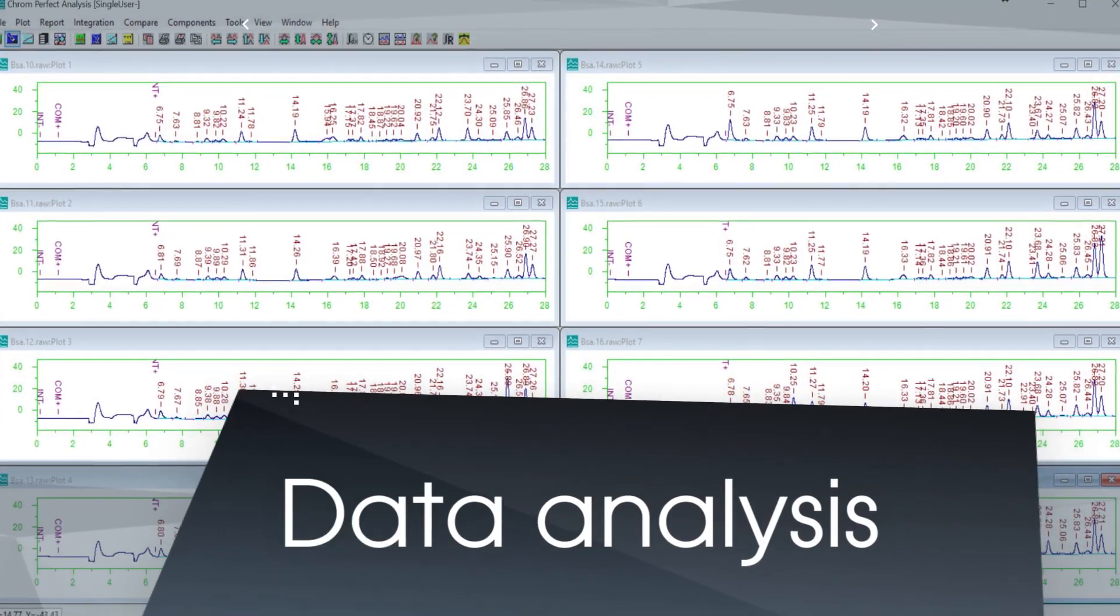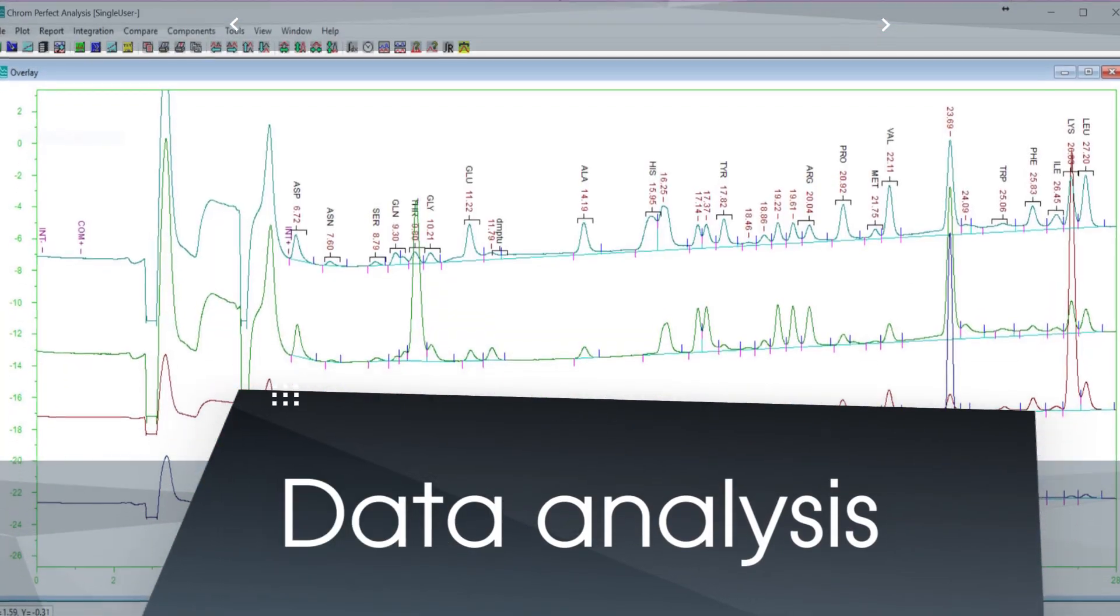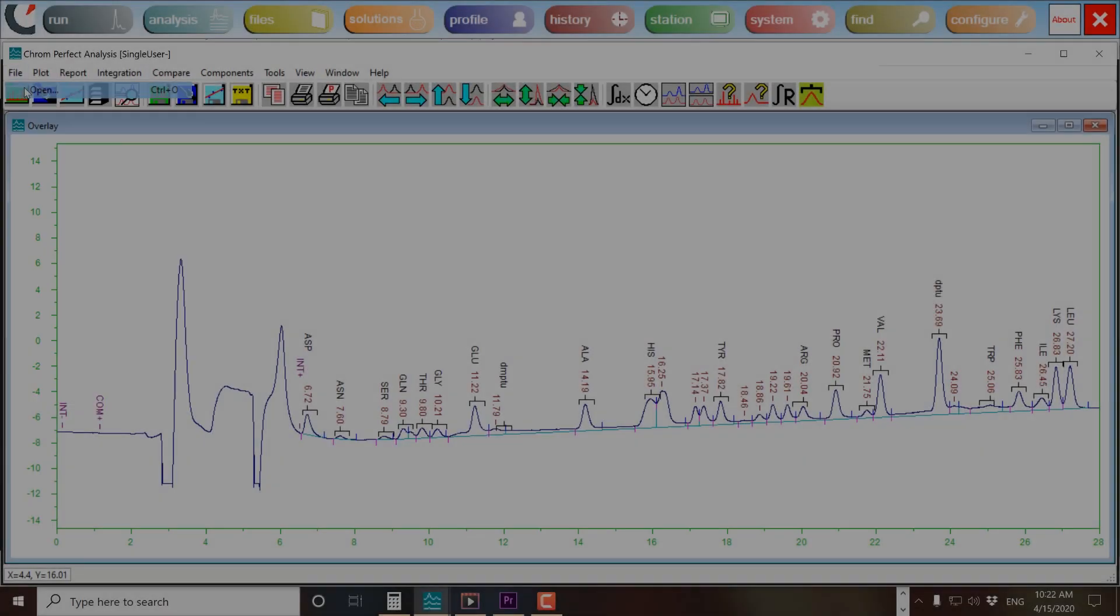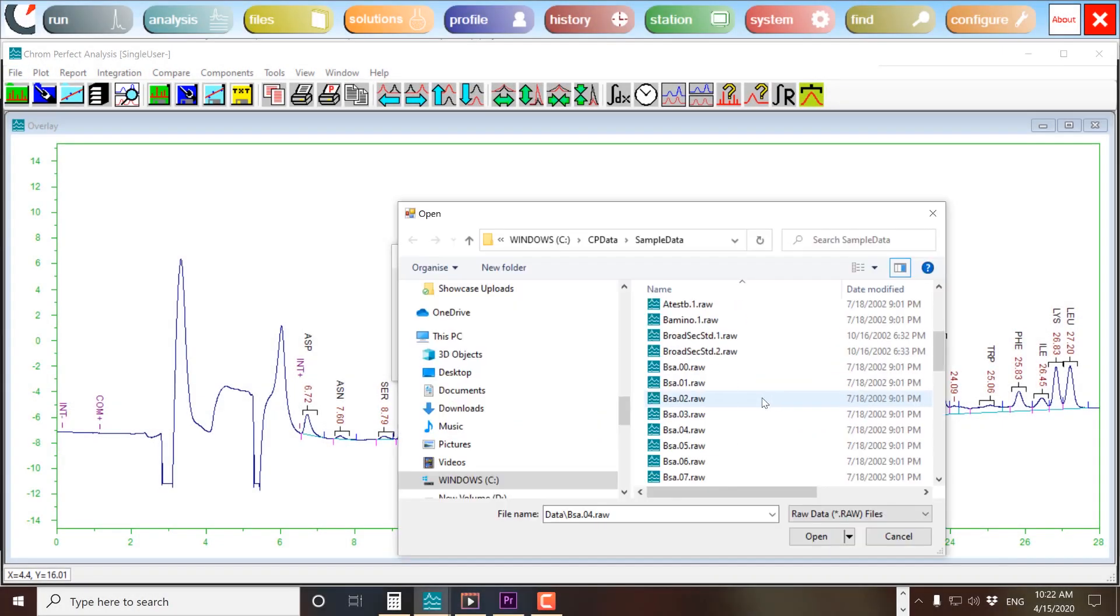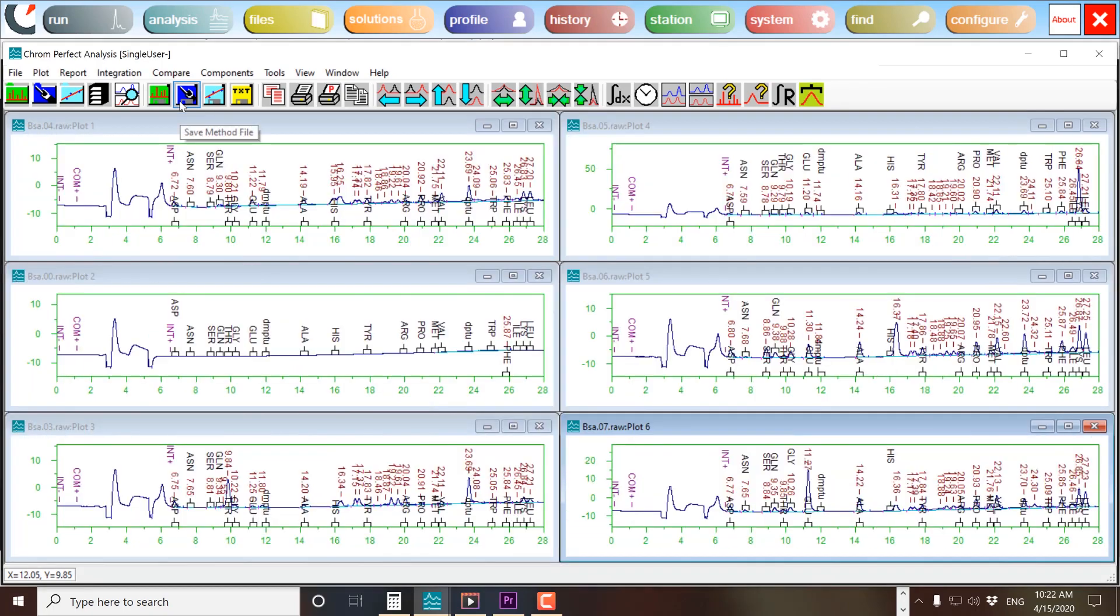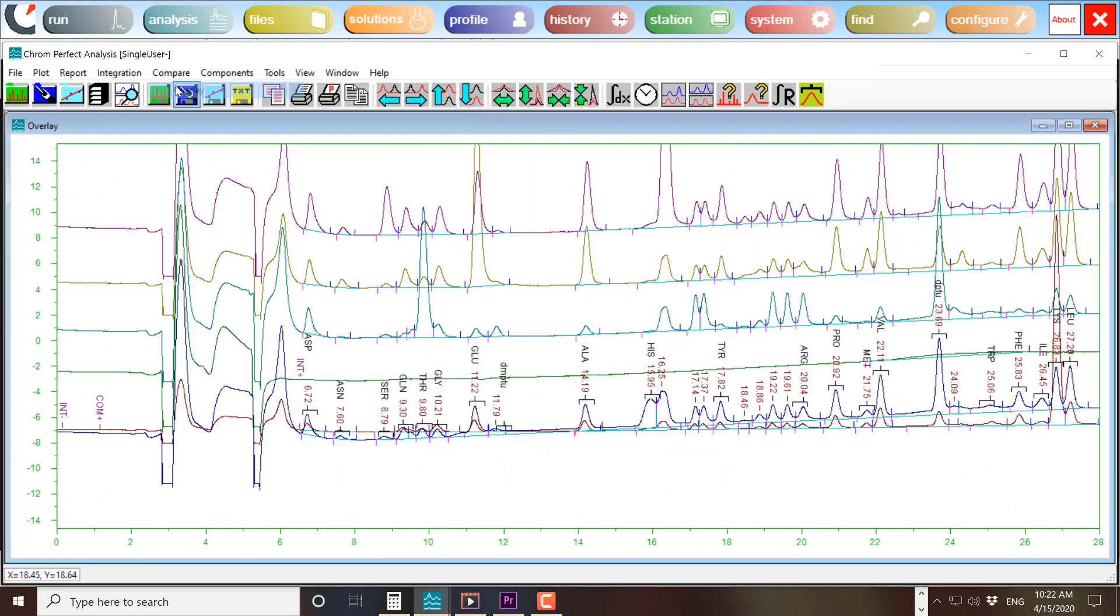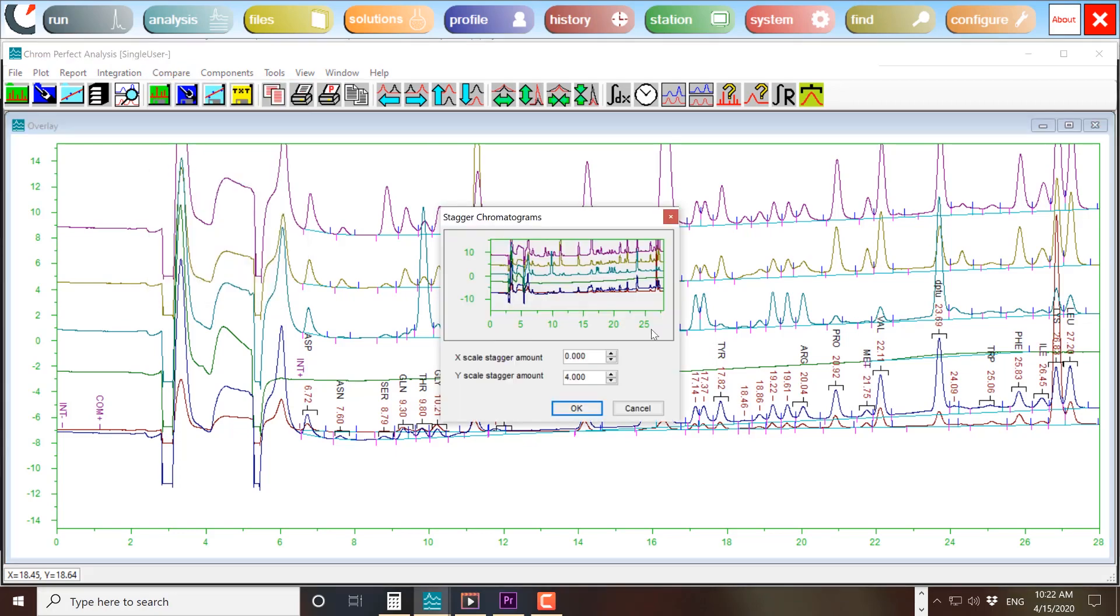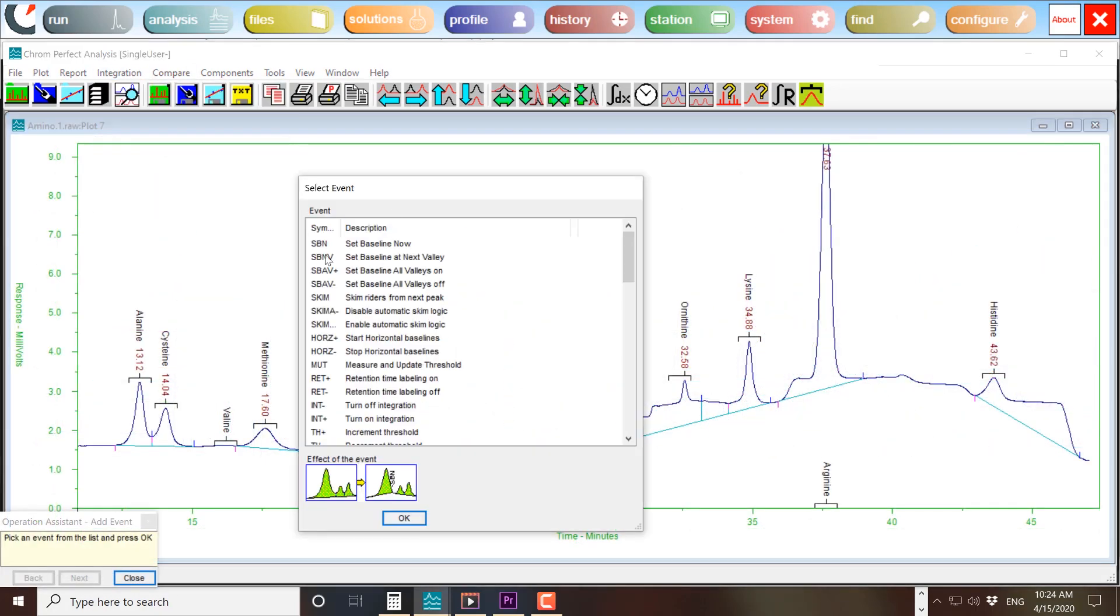Powerful data analysis. Easy to use and learn. Can your data system open and manage multiple chromatograms as easily as this? Can you dynamically switch from tiled to overlaid view? Can you make integration and baseline changes this quickly?